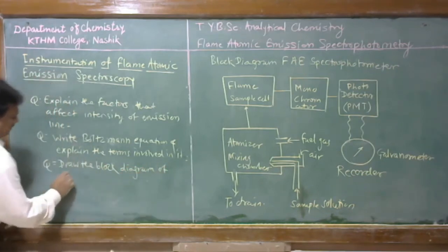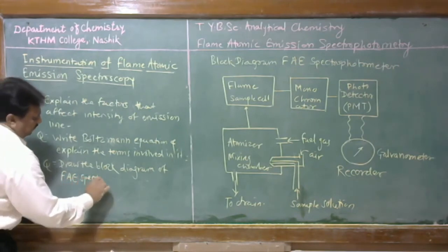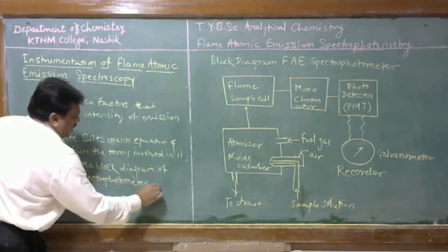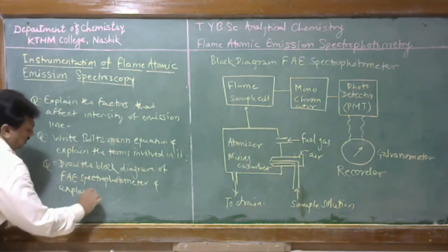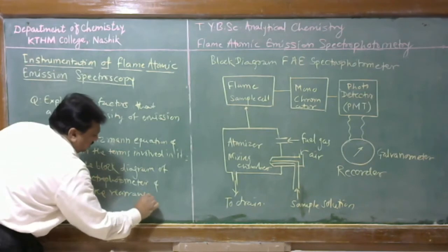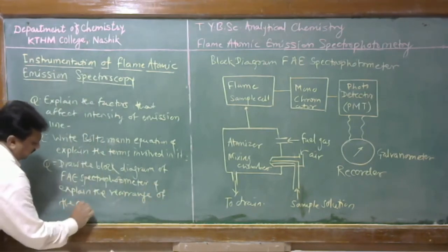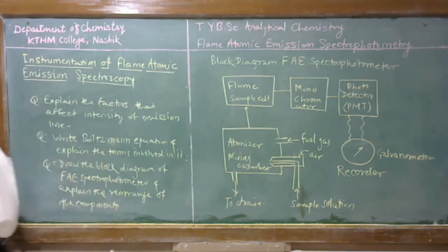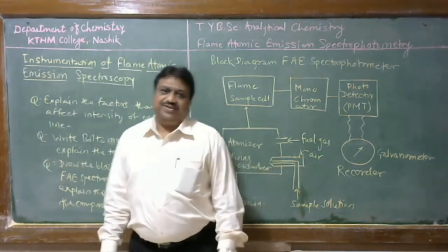Of flame atomic emission spectrophotometer and explain the arrangement of the components. Students, with today's discussion, you can find out the answers to this question.